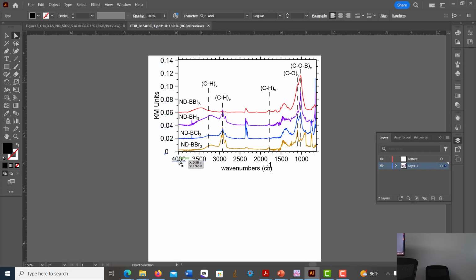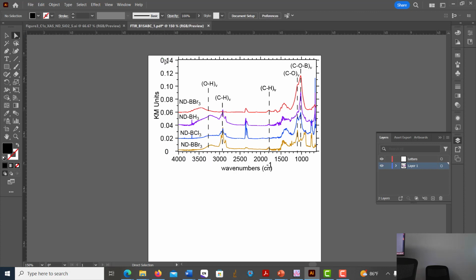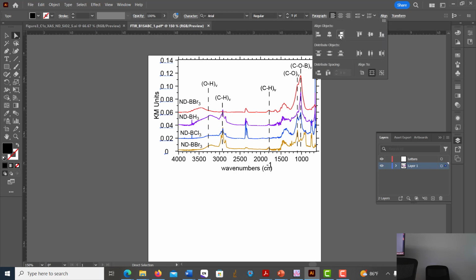Reverse that screw up. And now be more careful in my direct selection. As long as I'm in that general area, but I'm tight, like before I went down there, that was a boo-boo. I'm going to go over here, only select down to the 0, and you can see those. Now come back to the alignment tool, hit right, and it snaps into place.